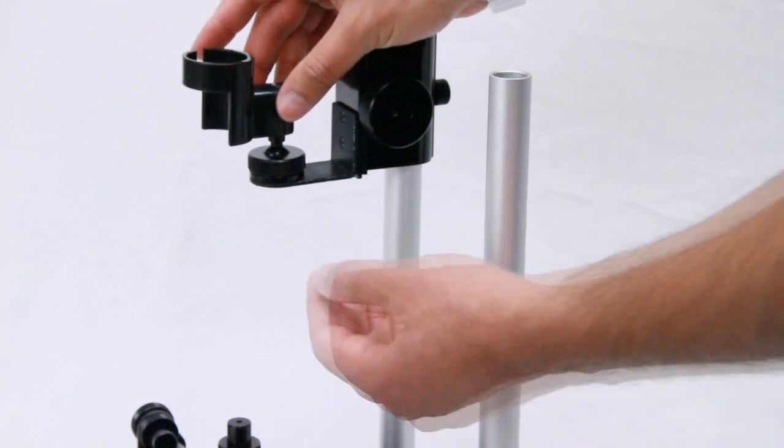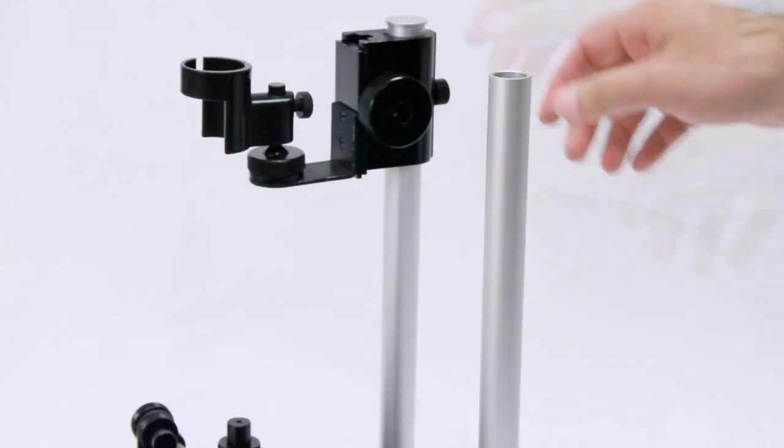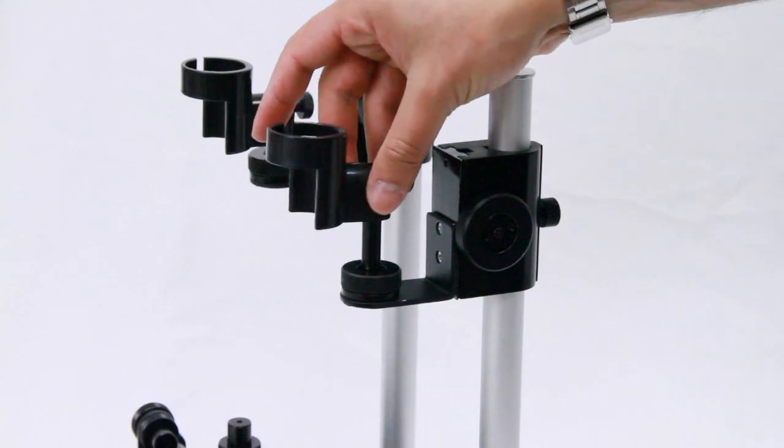Place the included holster onto the peg. The rounded edge is the top. Tighten the rear set screw to secure.